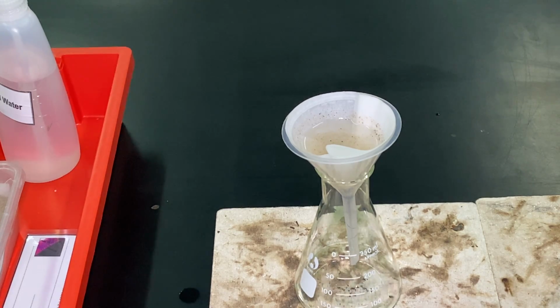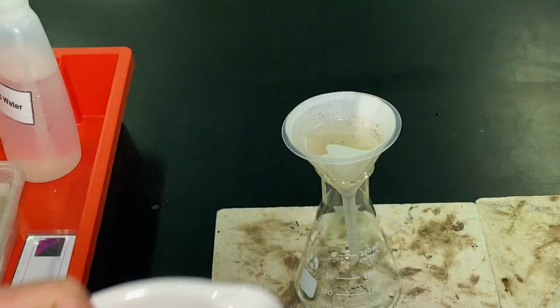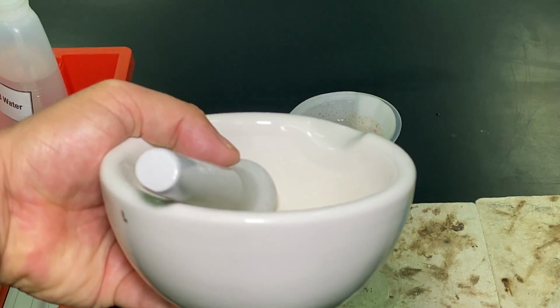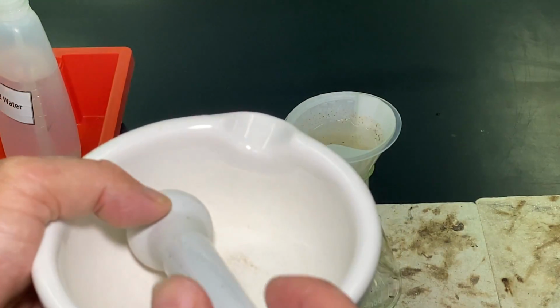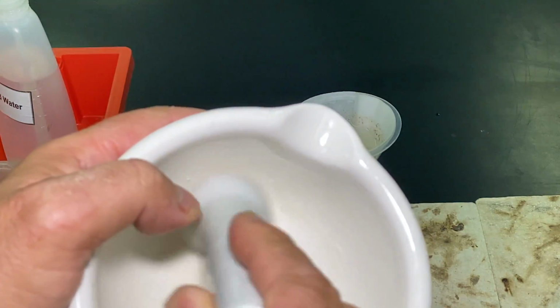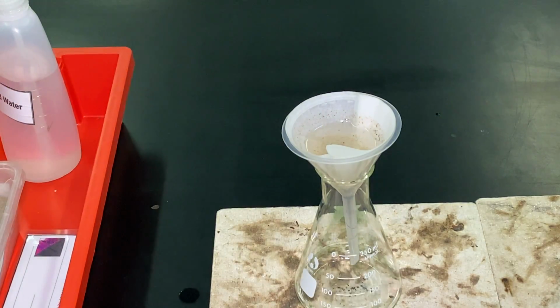So, like I said, quite a slow process, but all the rock salt that I crushed up with this has dissolved into the water. This, by the way, is called a mortar and pestle. This is the mortar, this is the pestle. Used in cookery a lot for grinding spices, and also used in chemistry quite a lot.